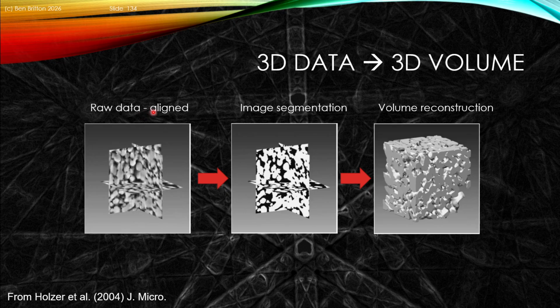So what you traditionally have to do is to take the raw data and then you have to perform segmentation. Now, fortunately, there are a number of different software packages, for instance, Avizo and Dragonfly, that have significant steps forward to make this relatively routine and easy to perform. Previously, what you might have to do is to color in every single slice. We'll see how that was done in an example data set from Dr. Angela Good that was kindly given to me.